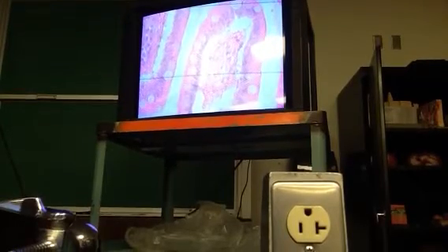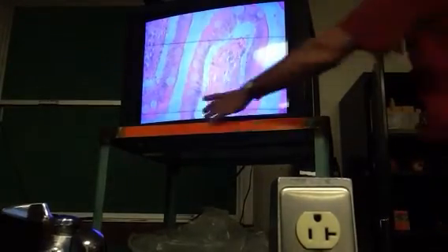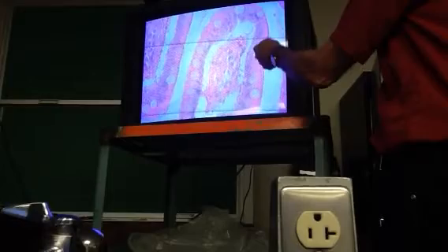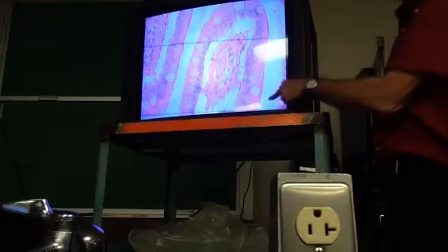Okay, let's see. If we look at the columnar epithelium here, on some of these, look at all the goblet cells. See, we've got abundant goblet cells. So there's simple columnar epithelium with goblet cells, loads of them. There's our lamina propria inside this villus. There's our brush border, strip of microvilli. Those are the things we look for on the villi, small intestine. And this is the tip of the villus. You see simple columnar epithelium with goblet cells. Goblet cells secrete mucus. There's the lamina propria. You see the brush border on the outside edge.